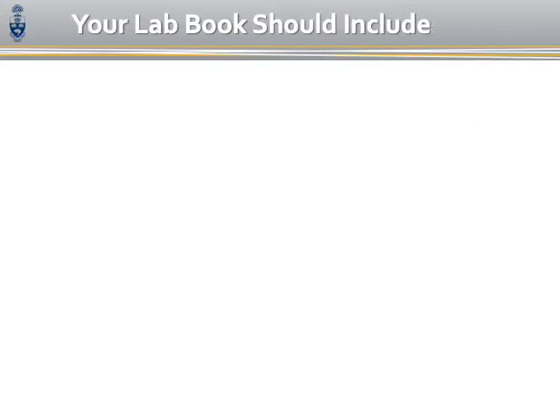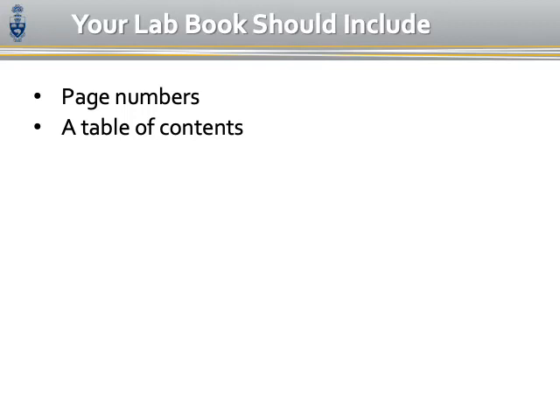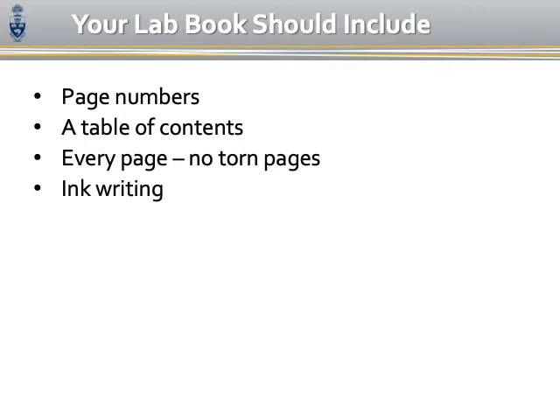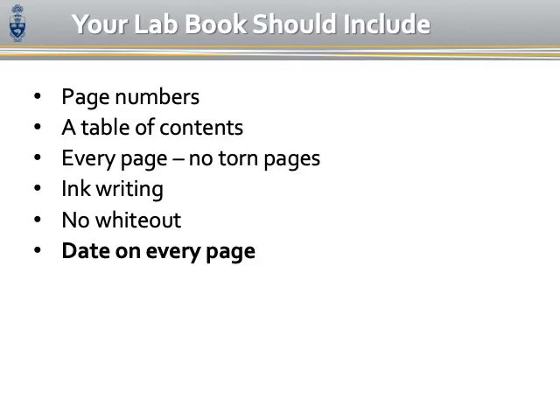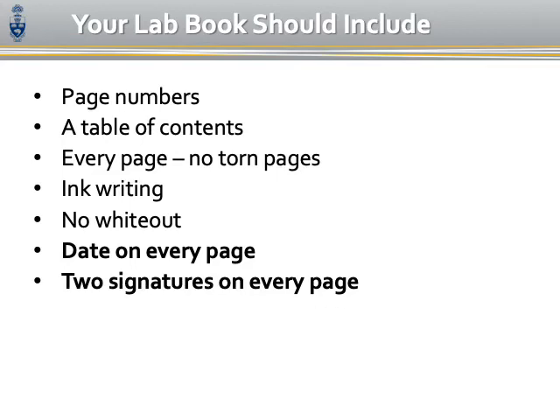What should your lab book include? First, there must be page numbers. If you buy a notebook without page numbers, write a number for every page. Leave a blank page at the beginning for a table of contents, which you can fill as you go. There are no torn or missing pages — every page should be intact. If you make a mistake, put a line through it. It must be written in ink with no white-out. There has to be a date on at least every page. On every page there should be two signatures: your signature and a witness who attests that these things were written in your notebook.